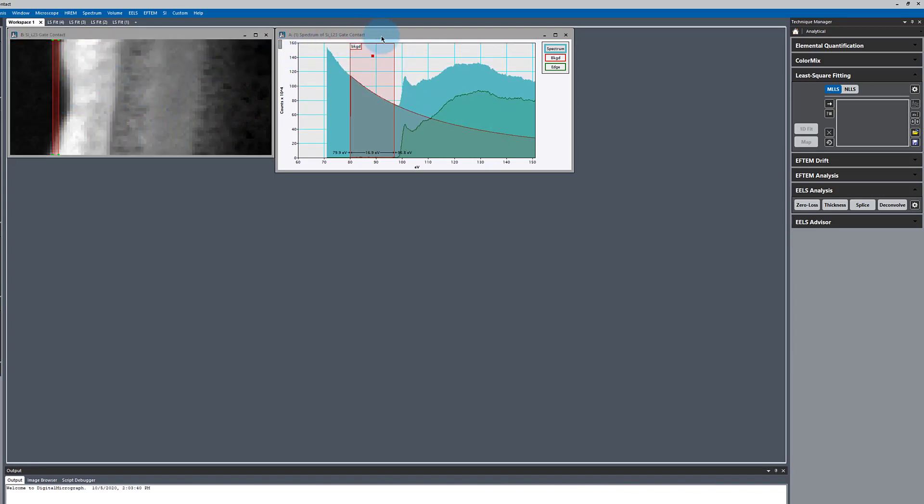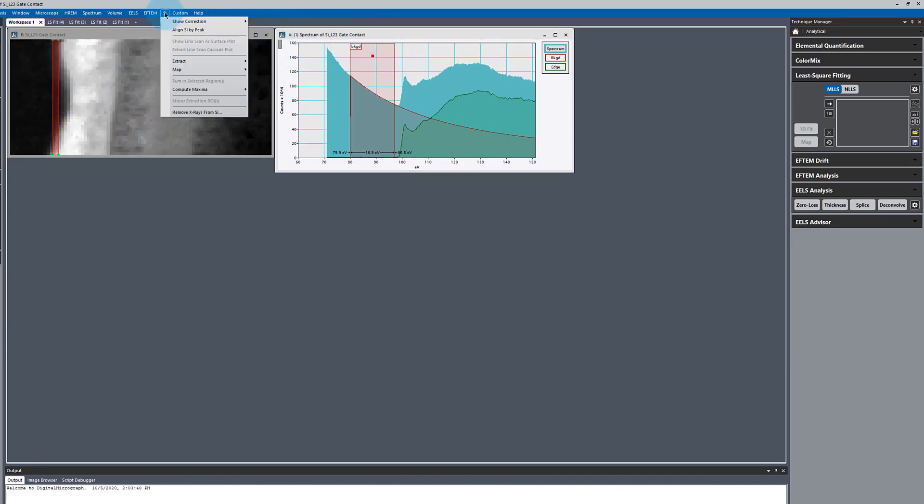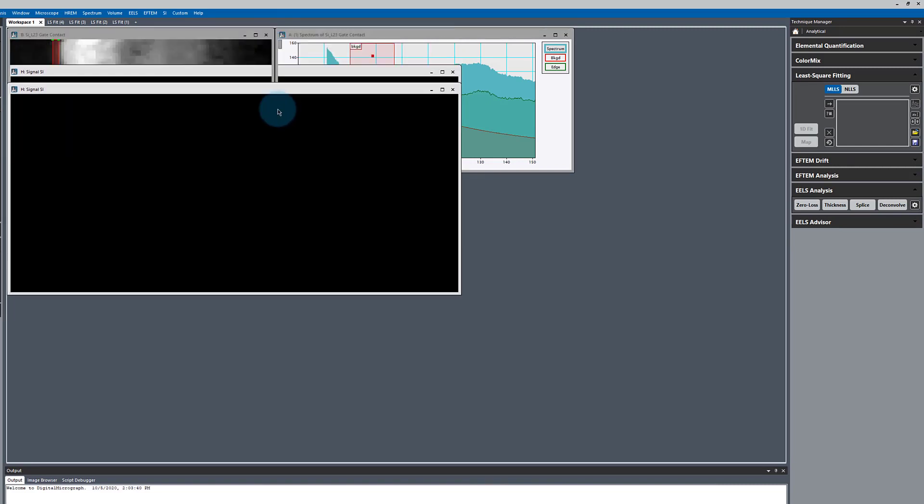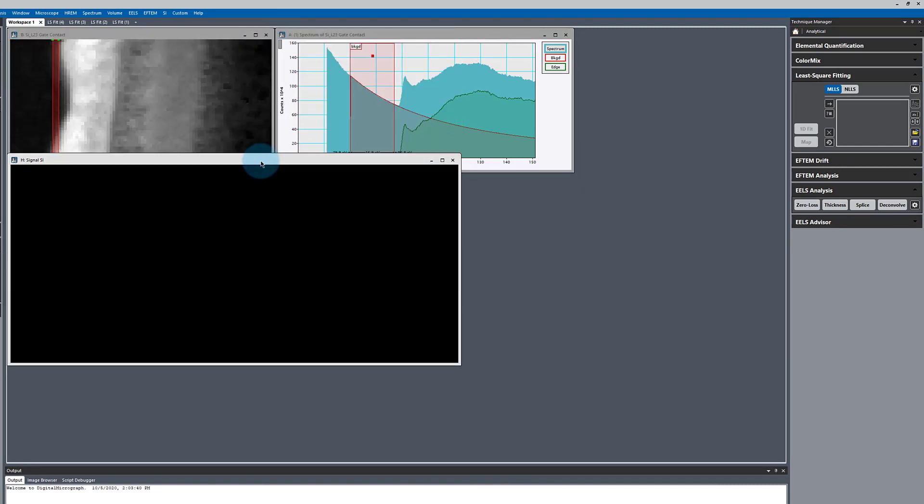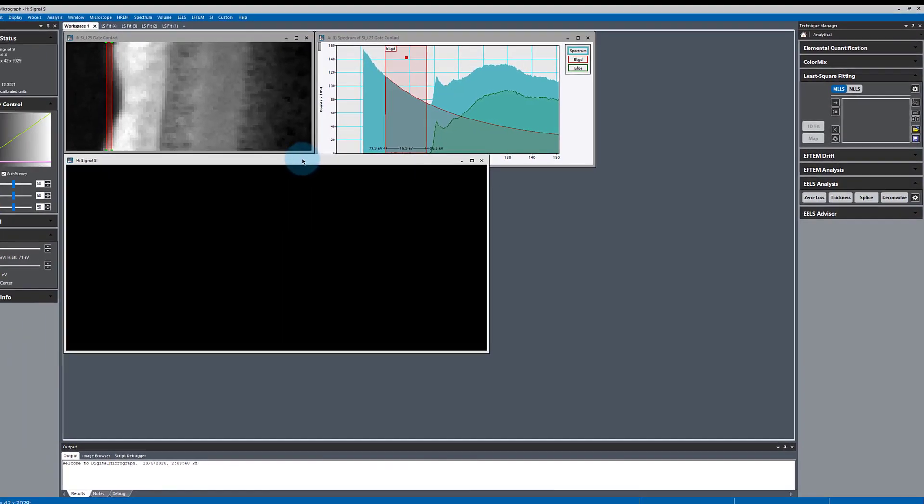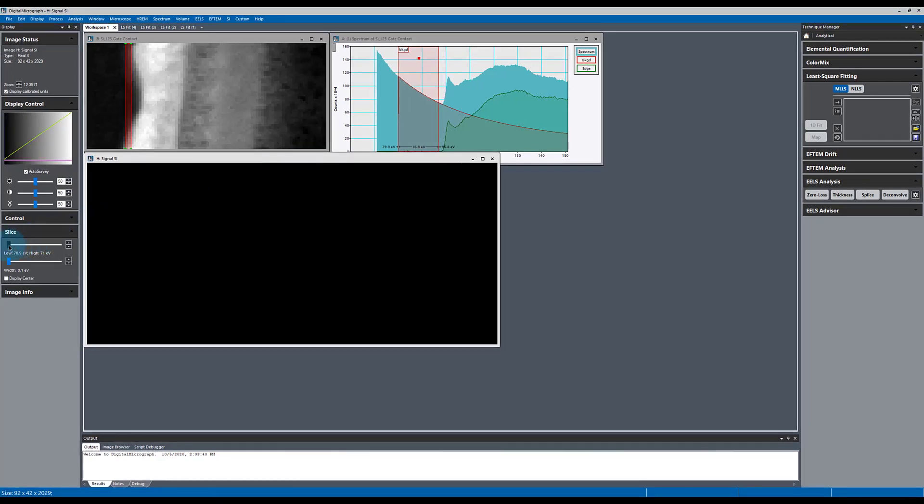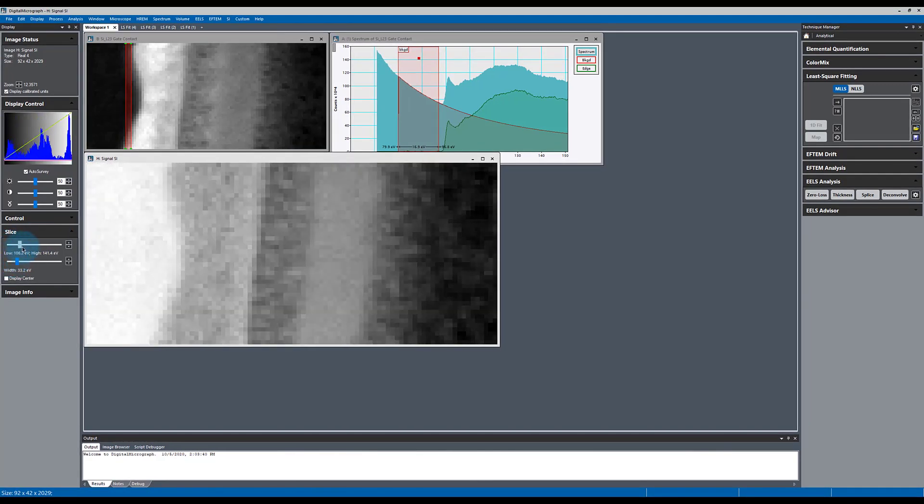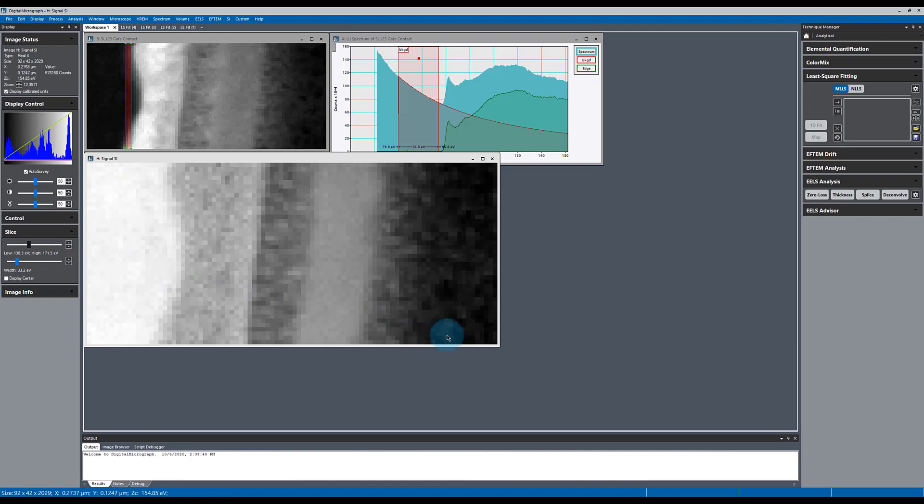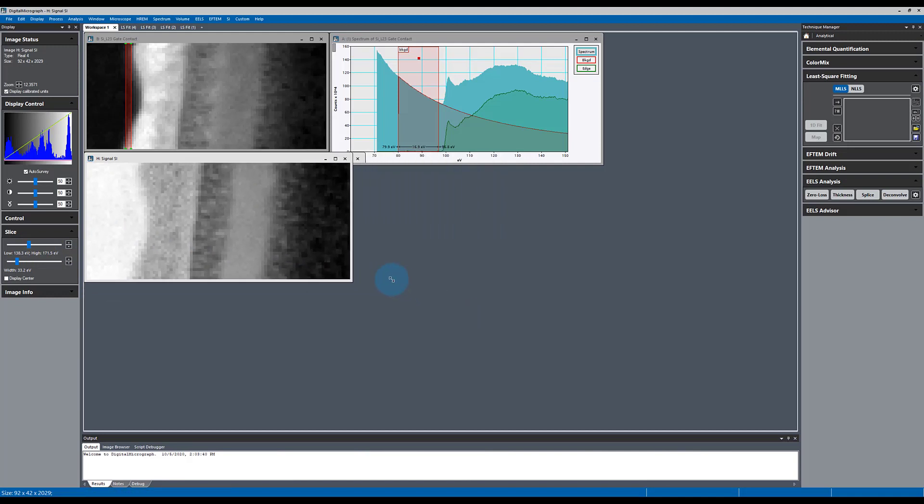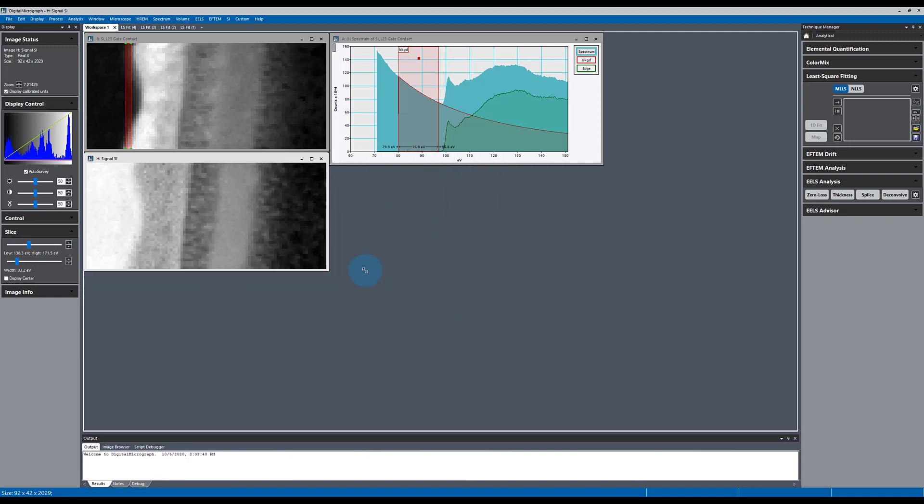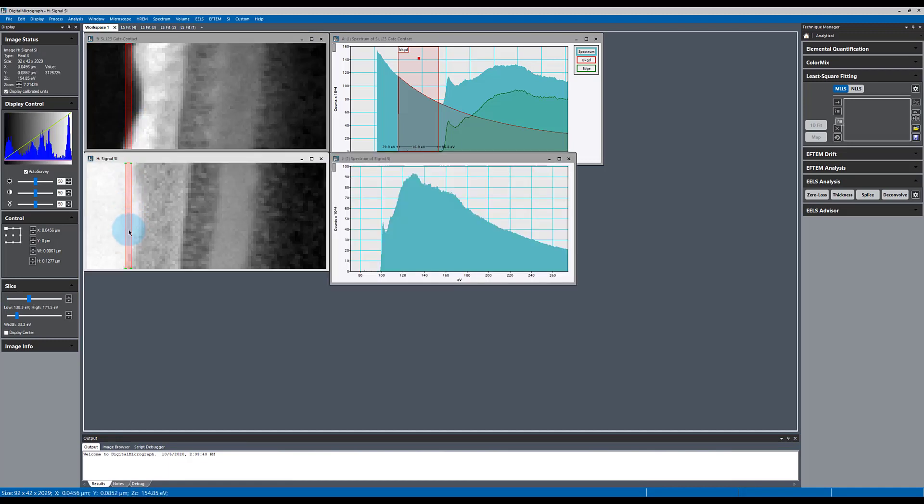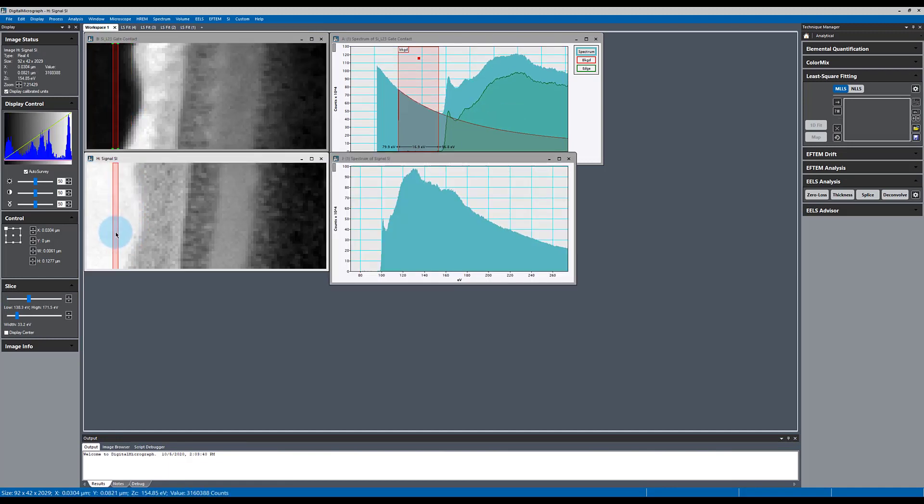What we're going to do is go up to where it says SI and say extract signal spectrum image. That's going to subtract the background from every pixel in the spectrum image. It may start off looking like nothing happened. That's just because it has a poor choice of where to put the first frame. This is exactly the same as this guy, but with the background already subtracted.